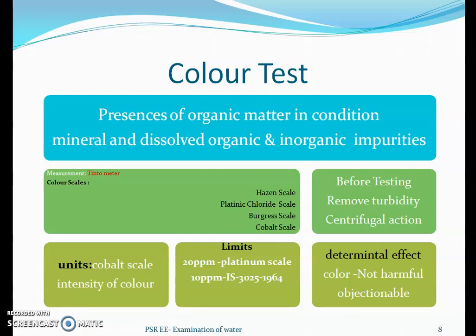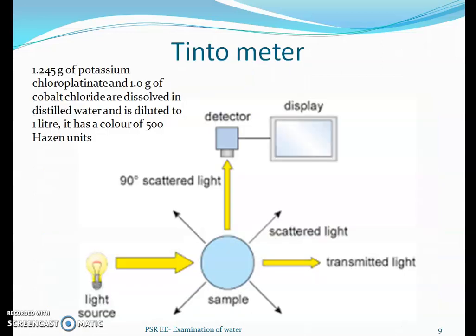The color is not going to cause any harm to human health, but it is objectionable. So we should not supply colored water to the public. Then how is it tested? Using the color test, with the tintometer.